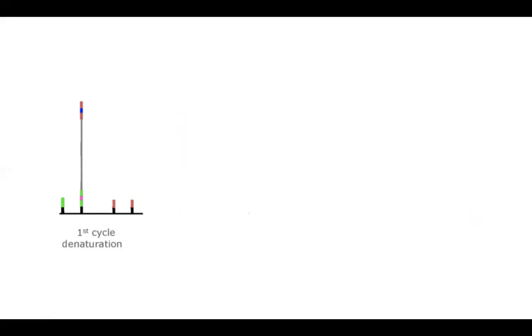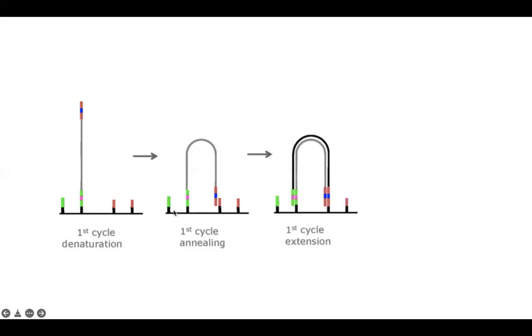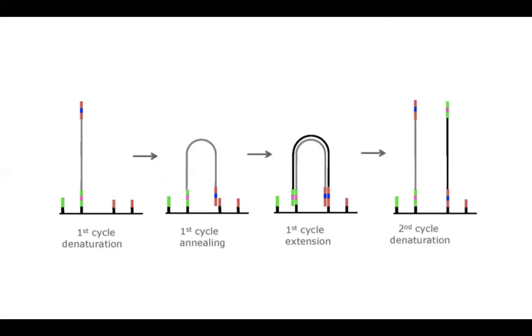And next, a bridge PCR will be performed. So again, the other adapter of your single-stranded molecule can bind to the next adapter or PCR primer, which is bound to the flow cell, which forms like a little bridge. It's named bridge PCR. And then this one is again elongated. And then after denaturation, there are two molecules bound.